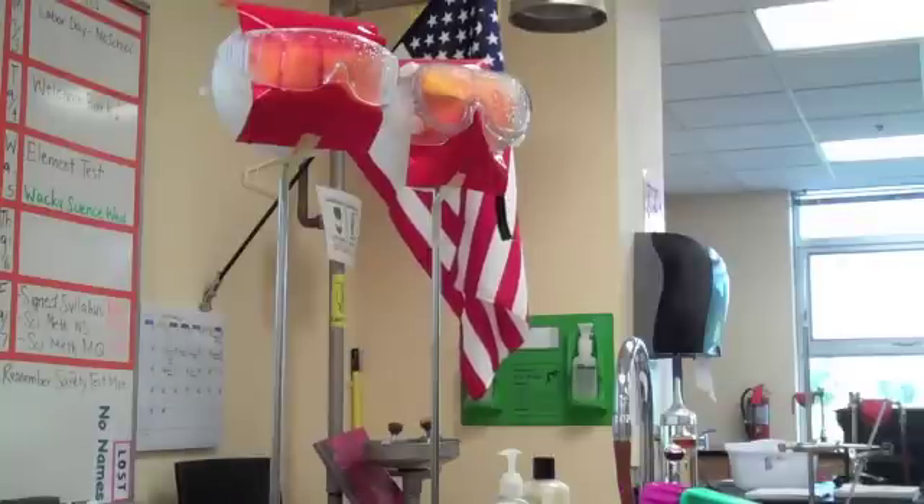Which one is doing a better job protecting? The one on the right, absolutely. The one on the left — that's not so good for those people's eyes. It's a cool shade of red, absolutely.